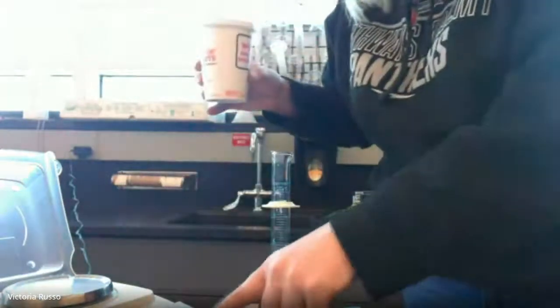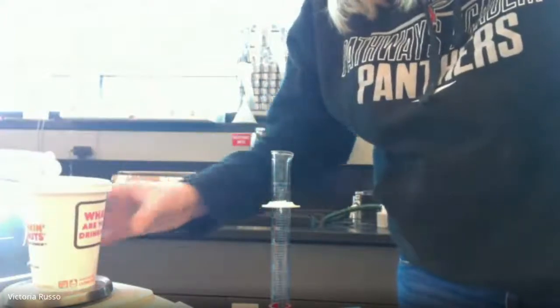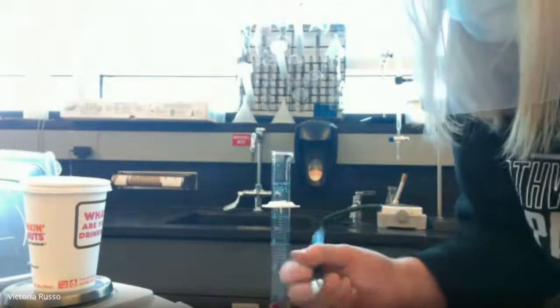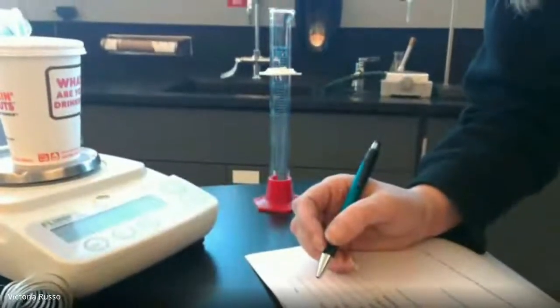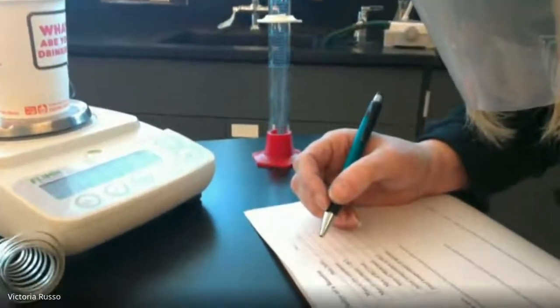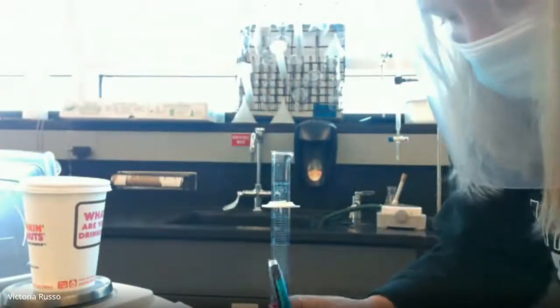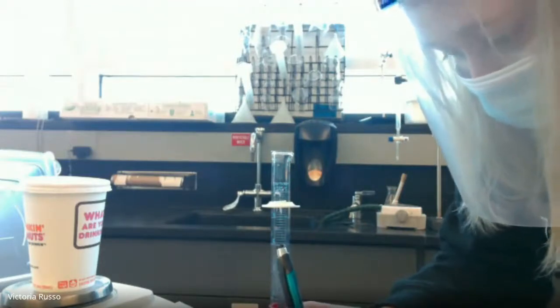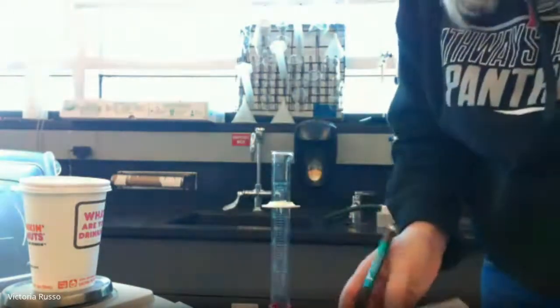And I'm going to zero the scale to just cancel out anything that's been on there before. And I'm going to put it on the scale and record the data. So the mass of the dry calorimeter, which I'm reading from the scale, I don't know if you can see it there. Maybe you can, maybe you can't. But I am just reading a number. The mass of the dry calorimeter is 12.332.